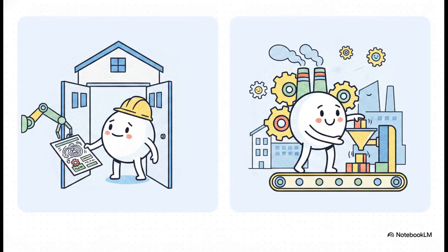There are basically two primary ways we equip this microscopic workforce for the job. First up is transient transfection. Think of this kind of like handing an instruction manual to the workers literally right before their shift starts. The producer cells are transfected with plasmids, which are basically the genetic instructions, afresh for every single production run. It's super flexible, but it requires a lot of high-quality plasmid DNA every single time.